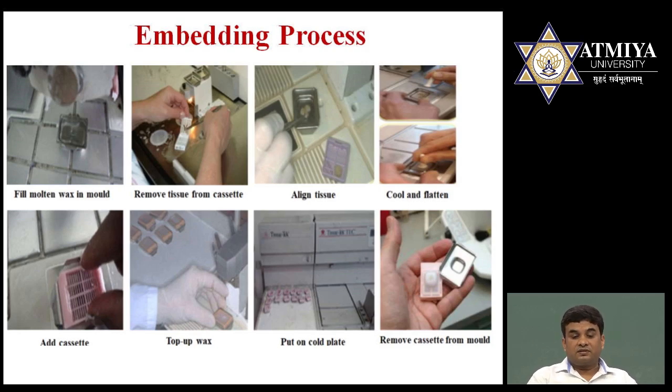So that's all about the tissue processing steps. In the next lecture I will discuss microtomy, the process of microtomy, and the different types of microtome.